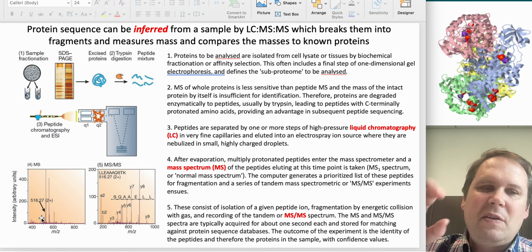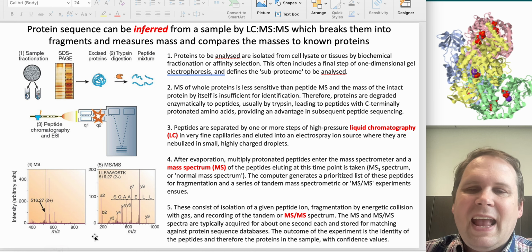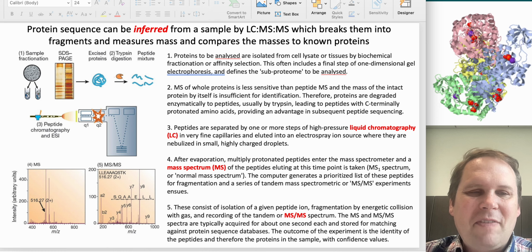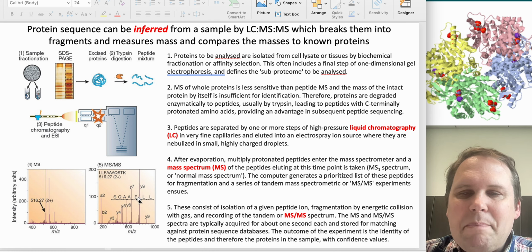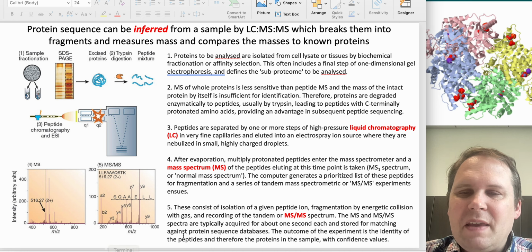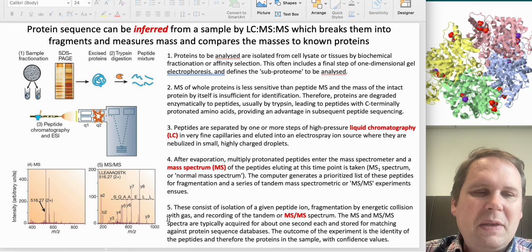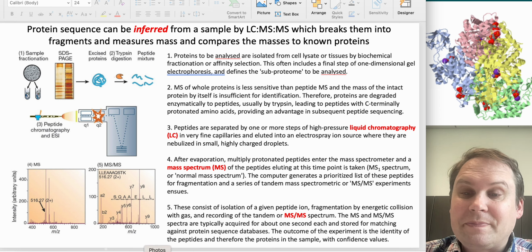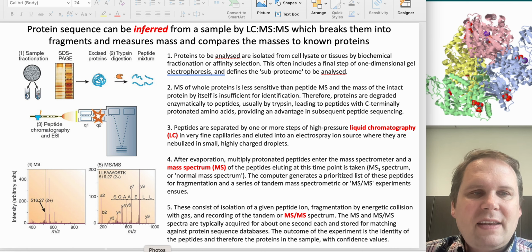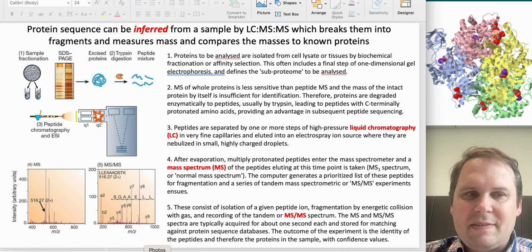And so you know the total mass of the fragment from step 4, and then you know a little bit about which amino acids are in the fragment from step 5. And with that, you actually get a partial sequence. You see the sequence comes out kind of backwards here, but yeah, that's like addition of each additional amino acid. Push it up here. So there you go. And so this is a technique that is widely used to estimate which proteins are present in a sample.